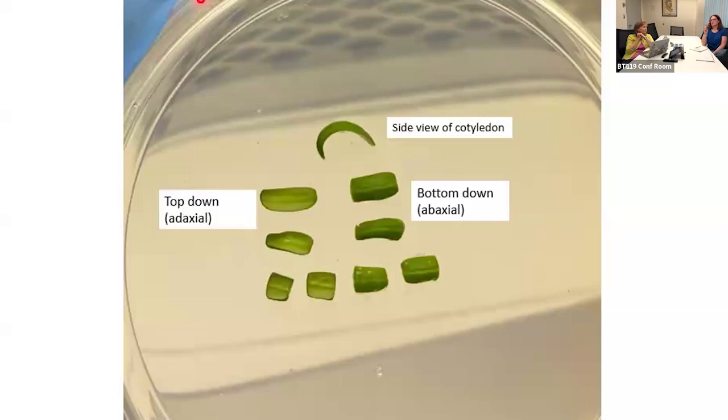I just want to add with this, because a lot of people do have issues with seeds, that seed packet to seed packet can be different. I want to stress how important the seed extraction method is. People think seed extraction is easy and have a student do it for them, but you really need to make sure your seed are being extracted from actually ripe fruit, and that you're getting your seed clean.